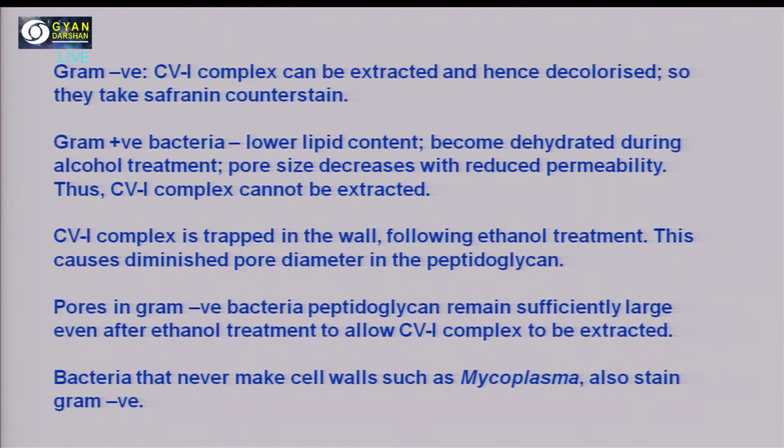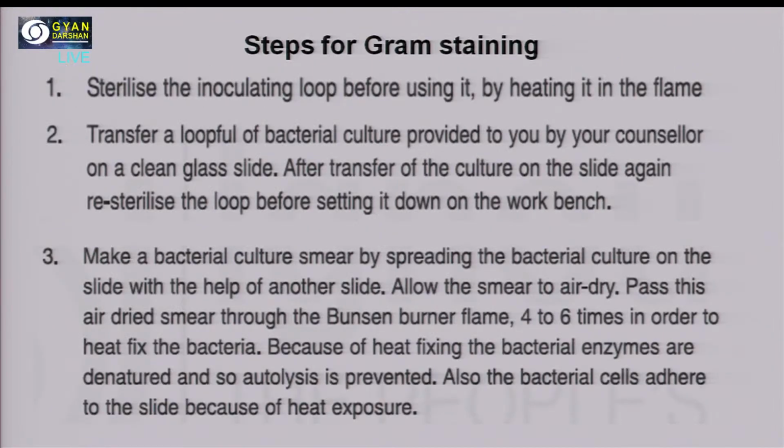Gram positive bacteria have lower lipid content and a thicker peptidoglycan layer, therefore the crystal violet iodine complex cannot be extracted, and they will retain the crystal violet color. So that is actually the principle.